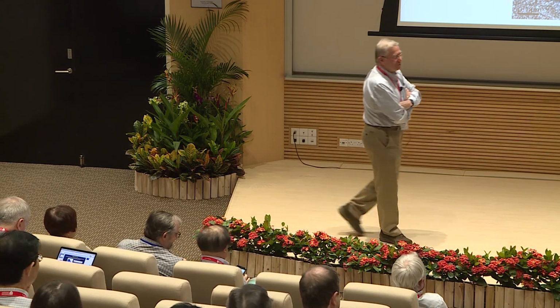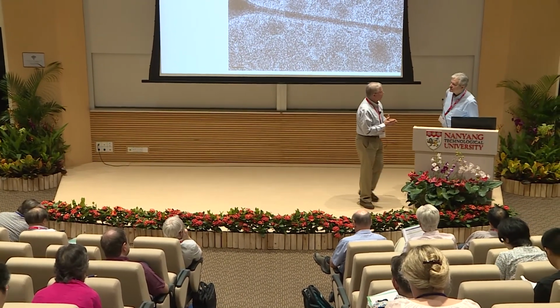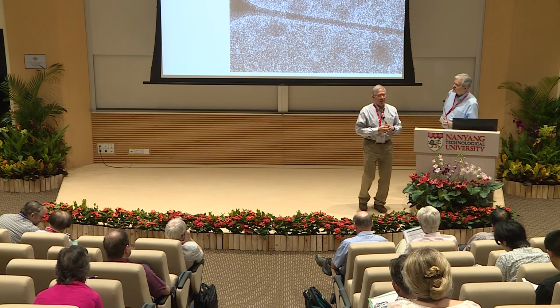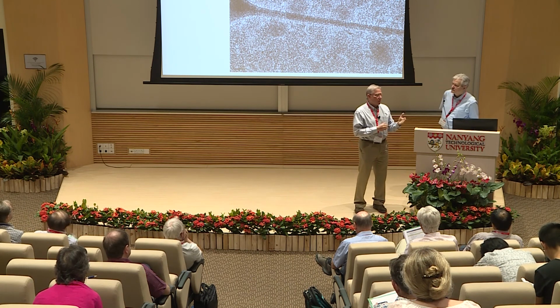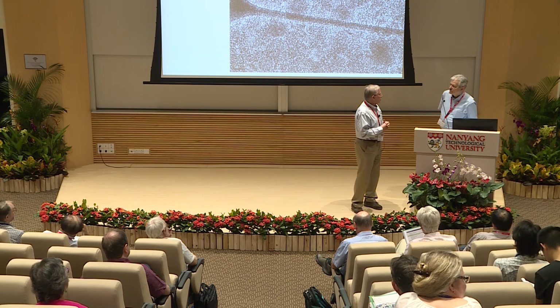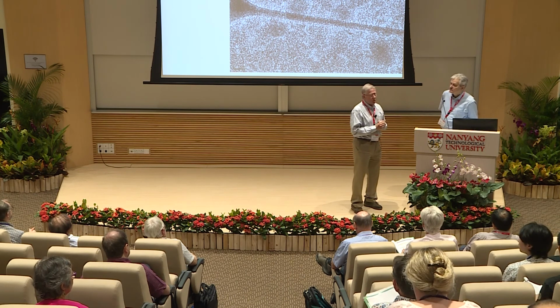Very good answer. So, maybe just one question to this fabulous new instrument. Is it a trick, or what does it do better than the old ones? Is there some correction in it? No, it does everything better. It has better optics. It has a better interface between the operator and the instrument. And then it has what I showed. It has better cameras and the phase plates, of course. Also, this instrument is 200 kilovolts, while the older one was 120.